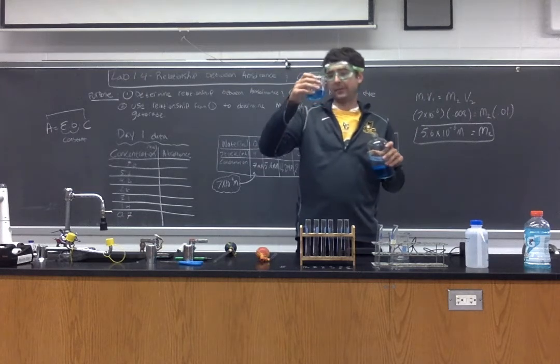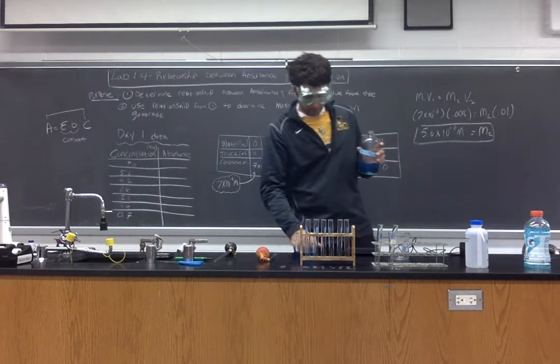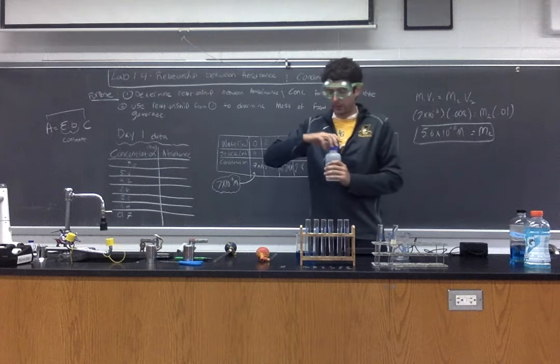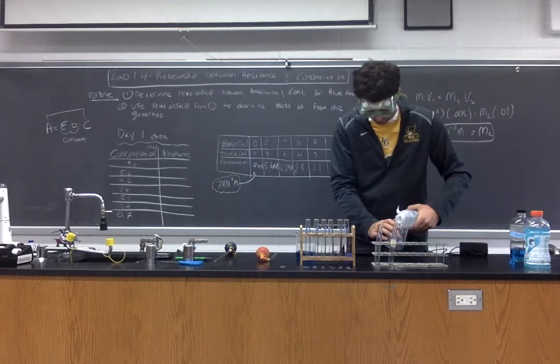I'm only going to be using about 50 milliliters of stock, so I don't need to use too much. I'm not going to pour too much there. And one beaker filled with deionized water.